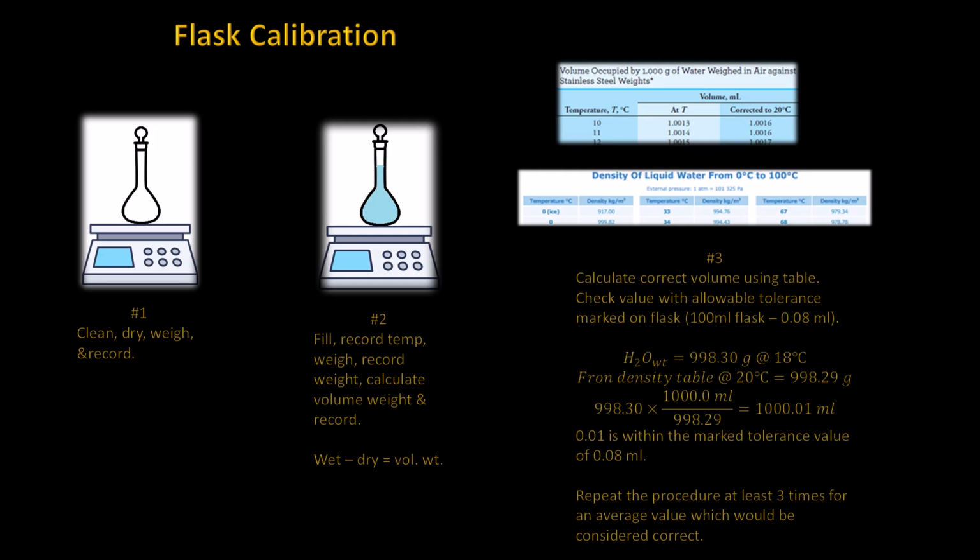To be more accurate, this procedure should be repeated at least 3 times, and the average volume taken from the 3 calculations would be the correct volume.